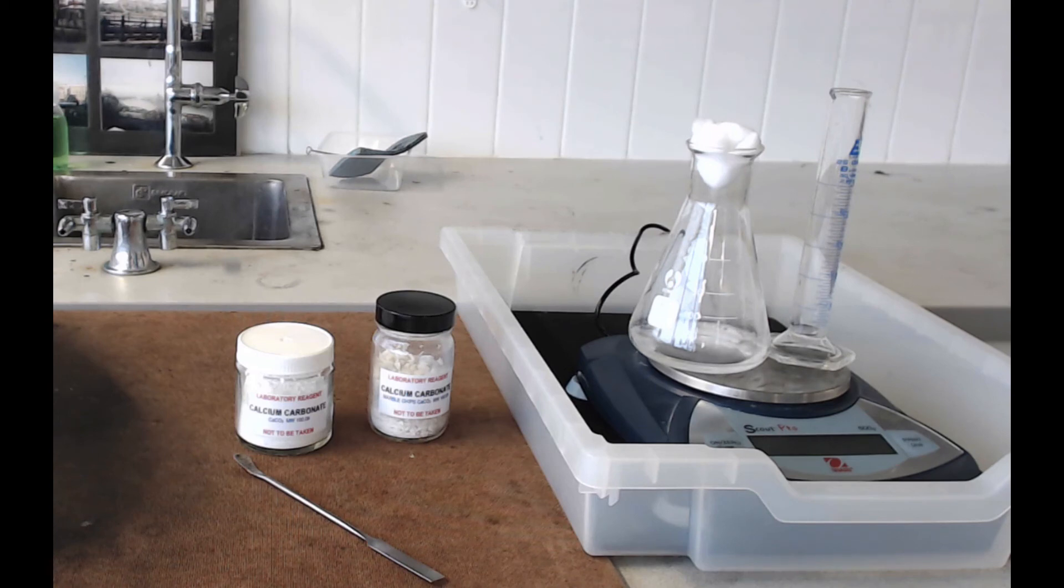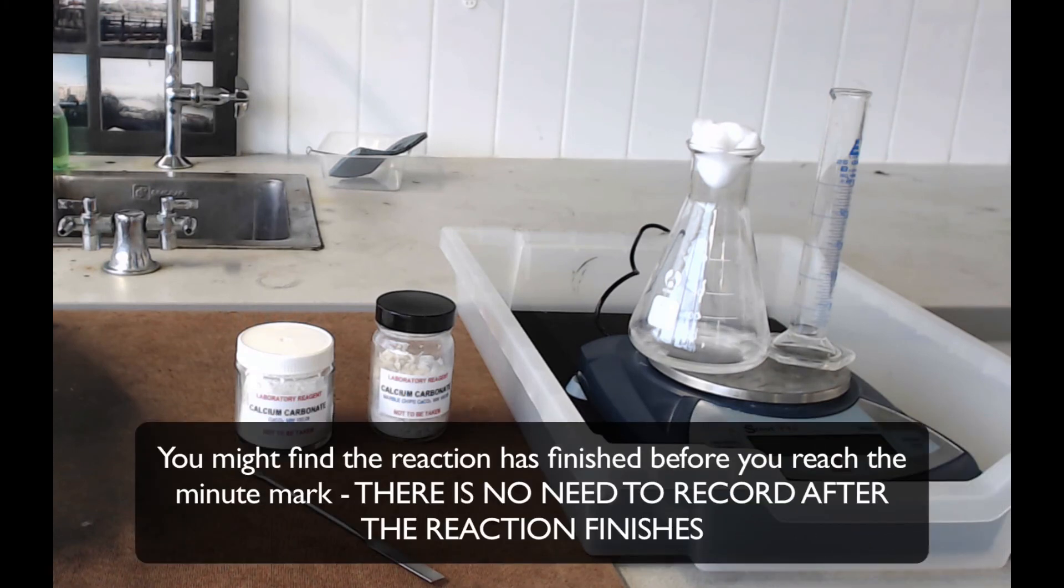All we need to do is record how much mass is lost every 10 seconds from this flask, up until we reach about a minute. Once you get to a minute, you can take all your equipment off the balance and record your results.